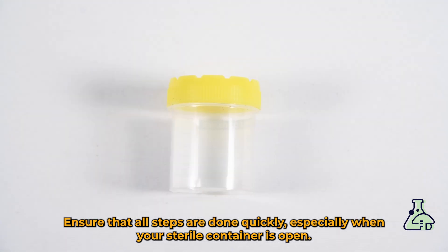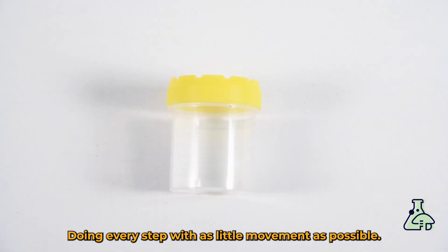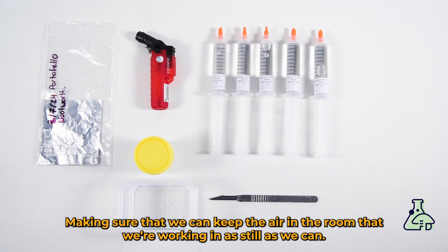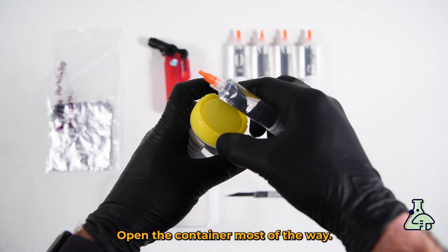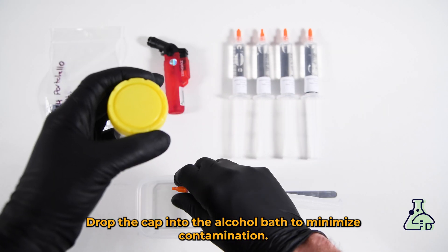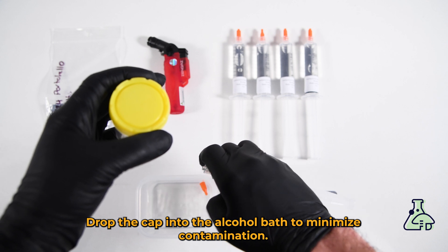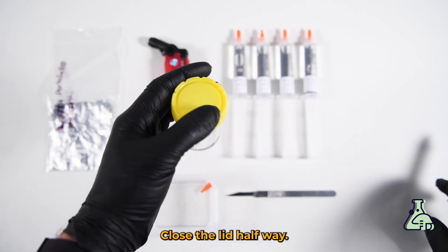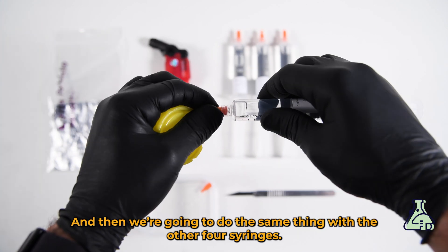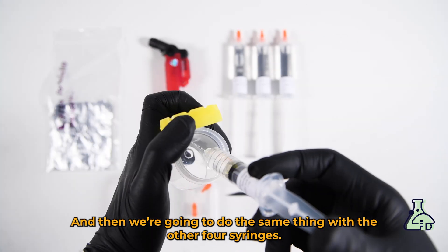Ensure that all steps are done quickly, especially when your sterile container is open, doing every step with as little movement as possible and making sure that we keep the air in the room as still as we can. We're going to half undo the cap of the syringe, open the container most of the way, drop the cap into the alcohol bath to minimize contamination, open the lid, and then drain the syringe into the container. Close the lid halfway and then do the same thing with the other four syringes.